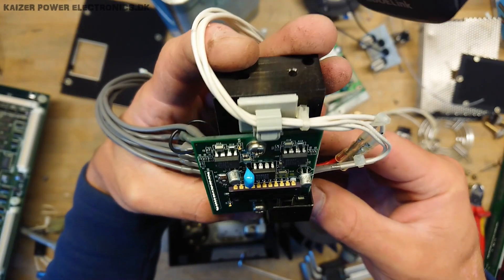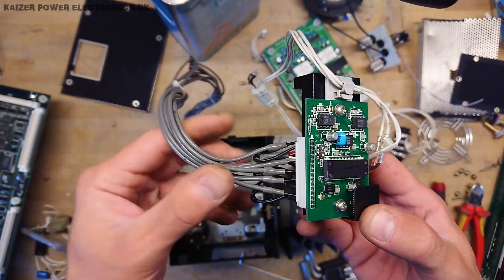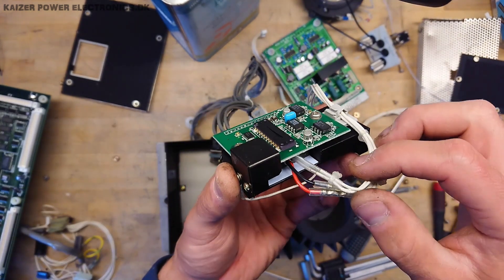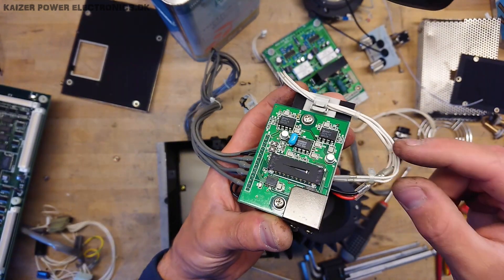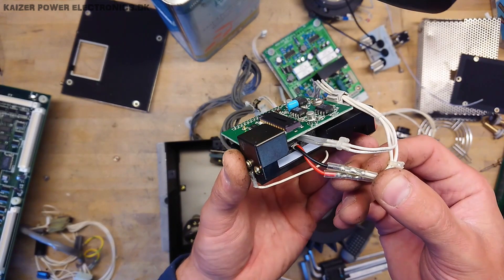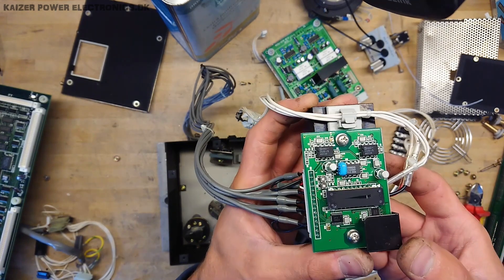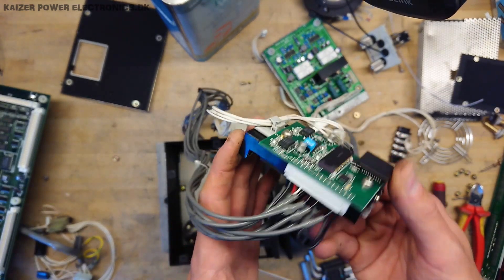Here we have the diode array detector itself — a gold-plated pin, ceramic package with all the data lines coming out. The four white wires going to the power supply seem to connect to the back of it — possibly power to the diode array detector, or it could be power out, because the two wires at the bottom are definitely going to a Peltier element. So this is a temperature-controlled chip, kept at a precise temperature to ensure its calibration always remains the same.